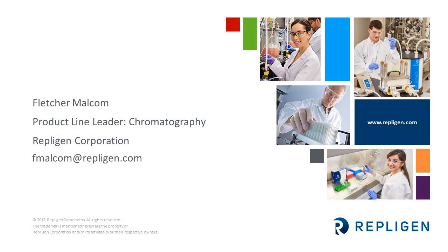Also, some of the binding characteristics of the resin is important from scaling. So yes, we do typically see bed heights maintained, linear velocity maintained, but some of those parameters can be influenced also by chromatography system, production volumes, flow rates, pressure limits, etc. So occasionally we see things like linear velocity actually decrease as you scale. And so it's really dependent on the process. But from a column perspective, if we just think about the column, yes, usually we would keep the bed height consistent once we get to sort of above the RoboColumn, the initial screening size.